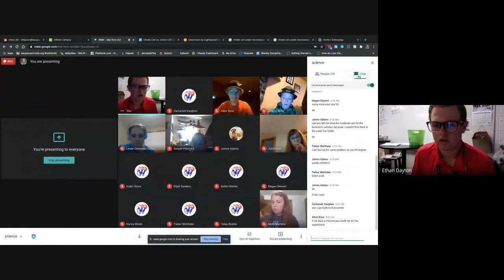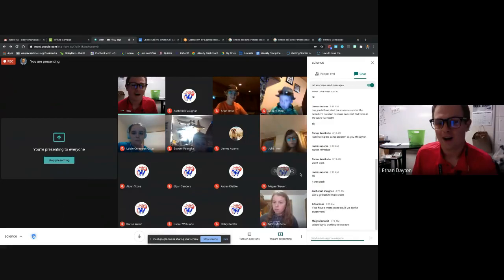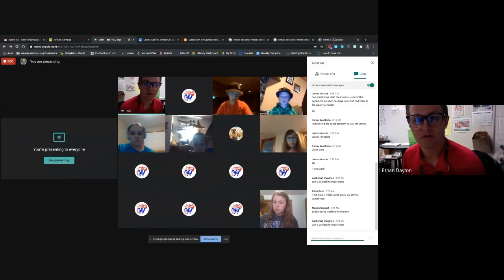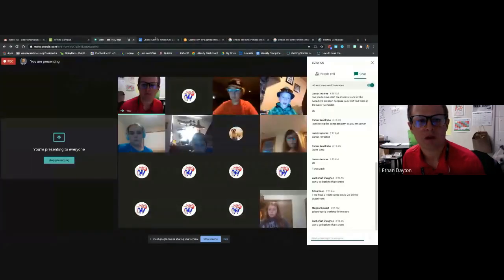Yes. If you have a microscope, sure, Alton, you could give it a shot. Do you have an onion? You do have a cheek. Yeah. Do you have toothpicks? Okay. So then we're going to get into this, and I'll tell you how you could do the experiment if you wanted, because it really is not that difficult if you have a microscope. Okay. So we're moving on.